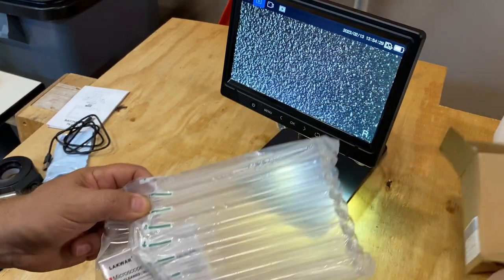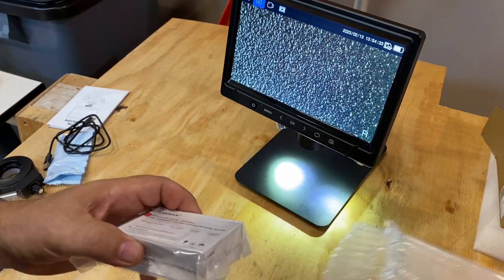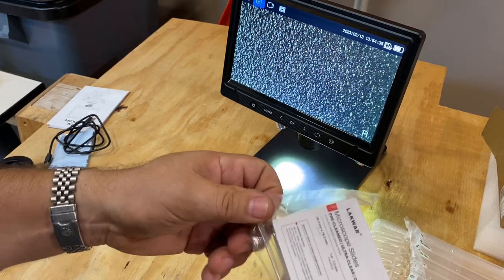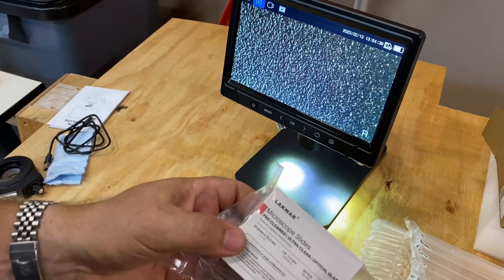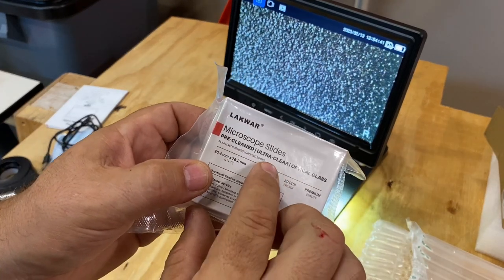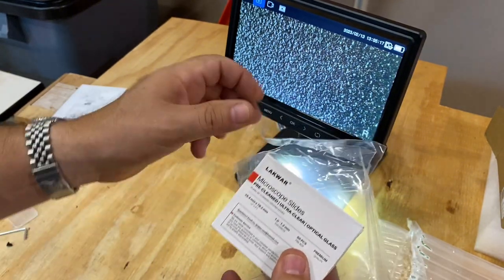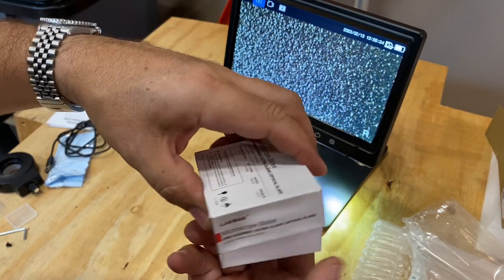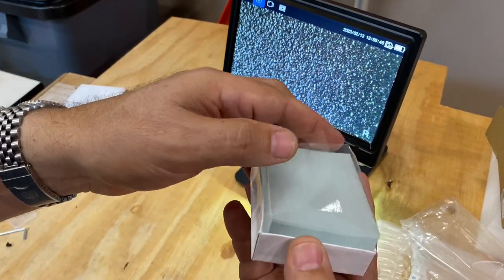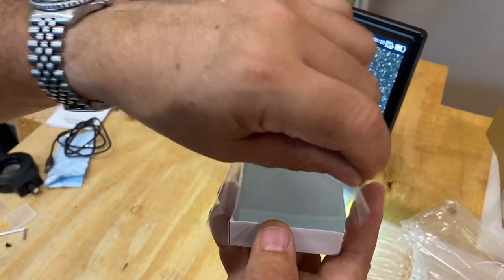These slides come very carefully wrapped in a bubble package so they're not going to get damaged in flight, and they are shrink wrapped to keep them completely sanitized and cleaned. These are pre-cleaned with ultra clear finish and optical glass. There's plastic covering the slides.